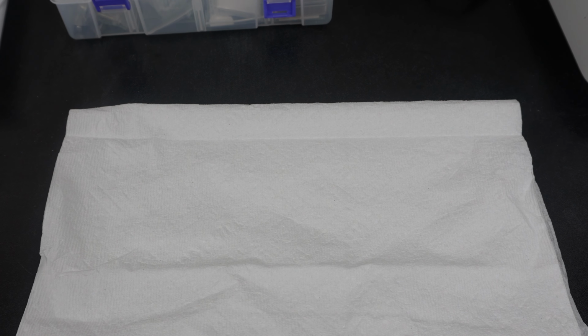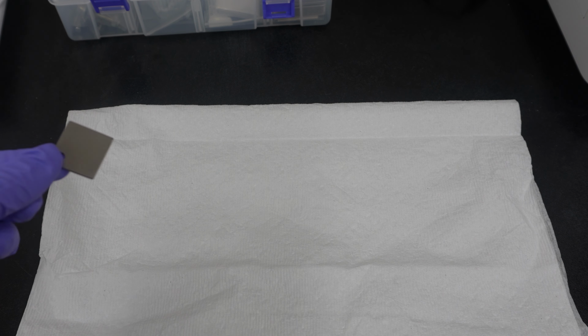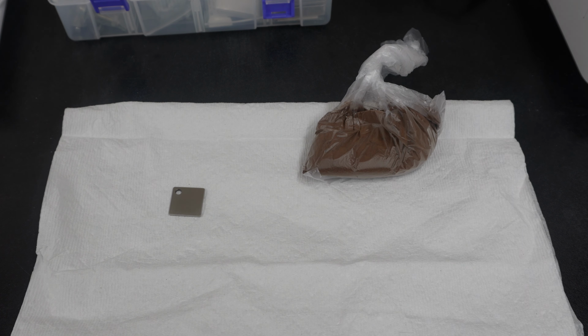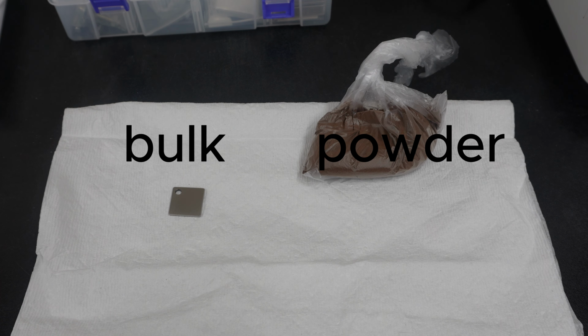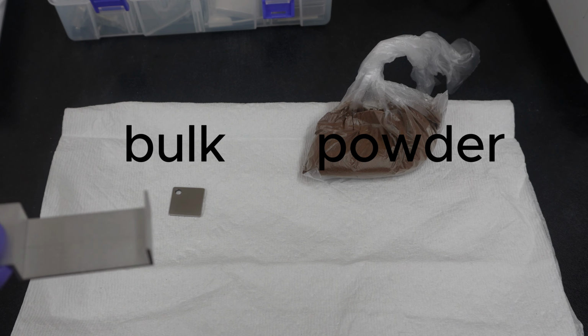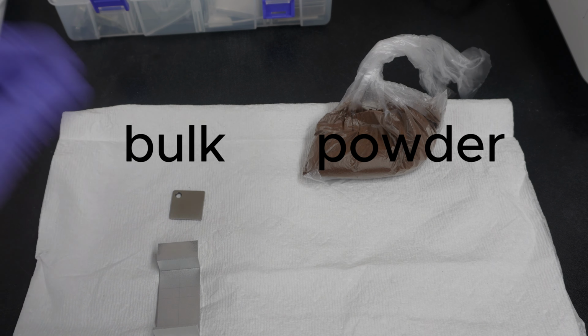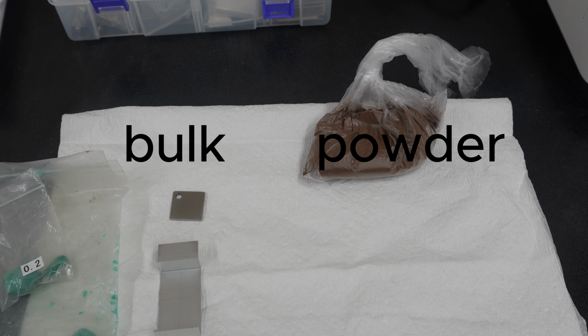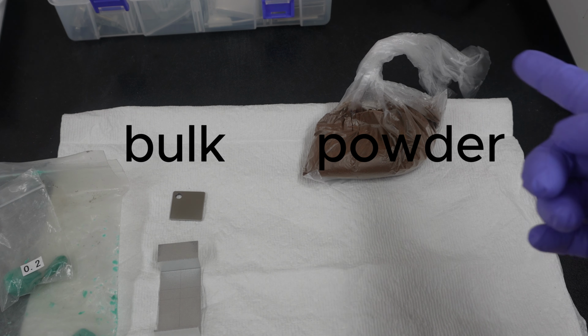So today we are going to prepare two samples for analysis. The first one is a bulk sample, and the second one is powder. And because they are so different, we need two different holders. This holder is for the bulk sample, and then we need to use clay to attach the sample on the holder.